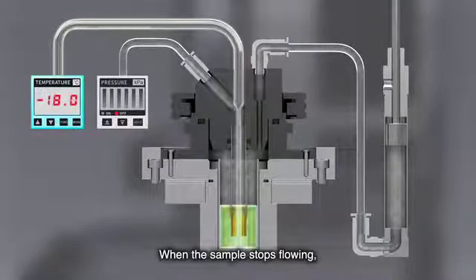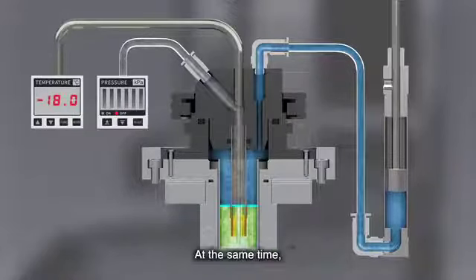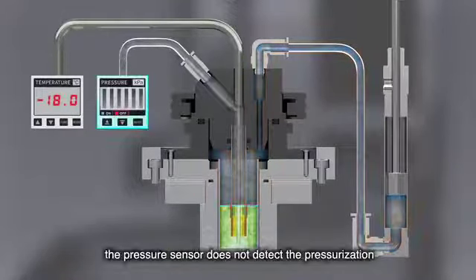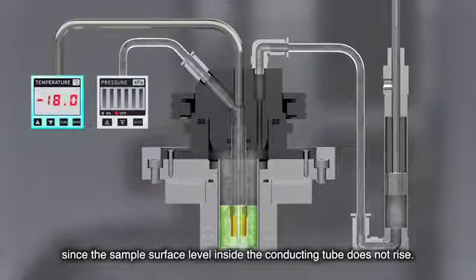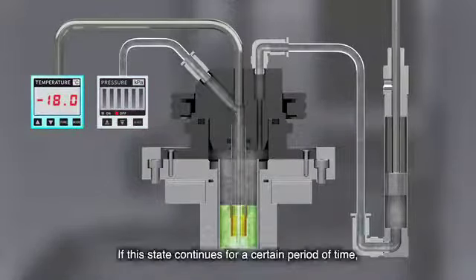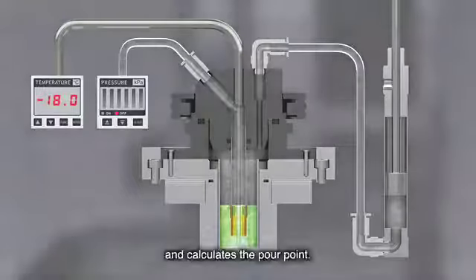When the sample stops flowing, the sample surface level outside the conducting tube does not drop even when pressurized. At the same time, the pressure sensor does not detect the pressurization since the sample surface level inside the conducting tube does not rise. If this state continues for a certain period of time, the device judges that the sample is no longer flowing and calculates the pour point.